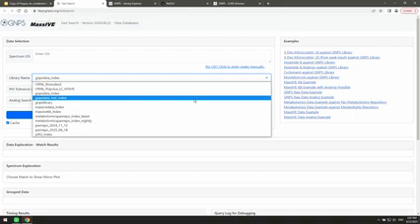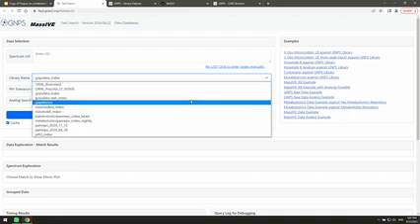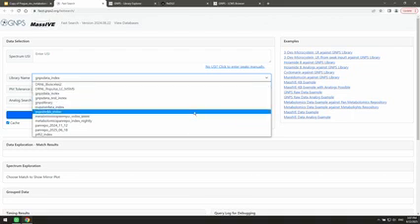Yeah. Yes. So what this represents is basically different indexes of the raw data, because the way MASST works is that we have downloaded all this public raw data. We then indexed every individual MSMS that we have in there. That's why we know how many MSMS are out there in the public space. So we really check for each individual one which peaks are in there. And depending on what data we downloaded, there are different things you can search, right?